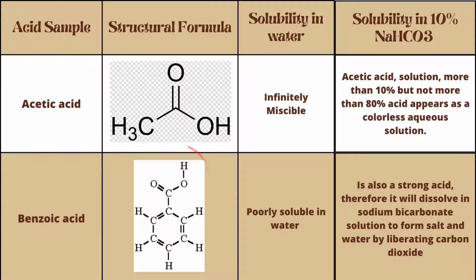Benzoic acid, structural formula. Solubility in water: poorly soluble in water. Solubility in 10% NaHCO3: it is also a strong acid, therefore it will dissolve in sodium bicarbonate solution to form salt and water by liberating carbon dioxide.